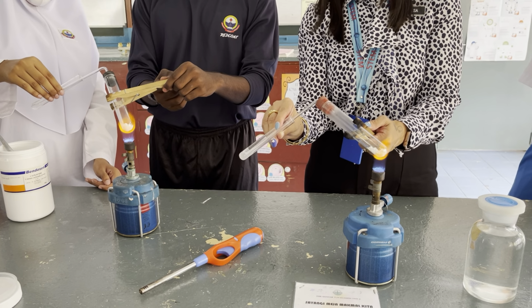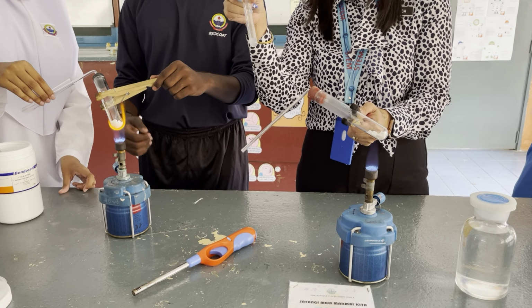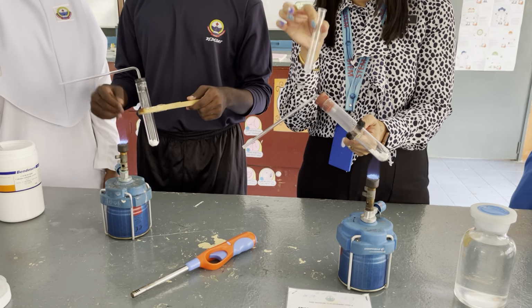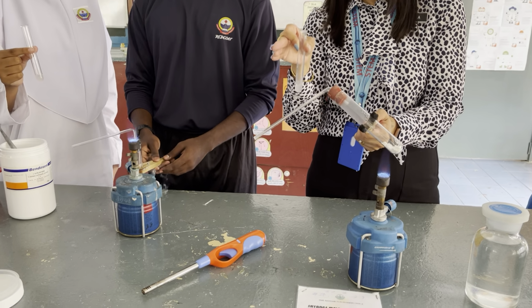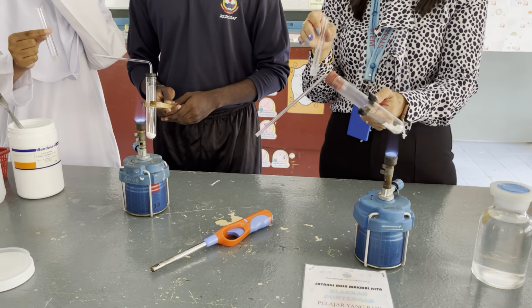Carbon dioxide. That means when you actually heat up calcite or calcium carbonate, you get carbon dioxide. Meaning that calcite or calcium carbonate consists of more than one element. Carbon, calcium, oxygen. Okay? Okay, can stop the first part.